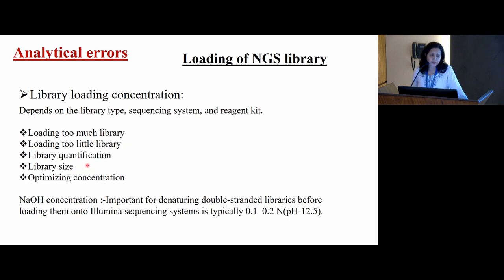The size of the library is also important. As Swapnali has told you, NaOH is used for the denaturation of the double-stranded DNA. For the MiSeq and MiniSeq platforms, we have to do this off system, and the concentration should be 0.1 to 0.2 normal. But in NextSeq it is onboard.